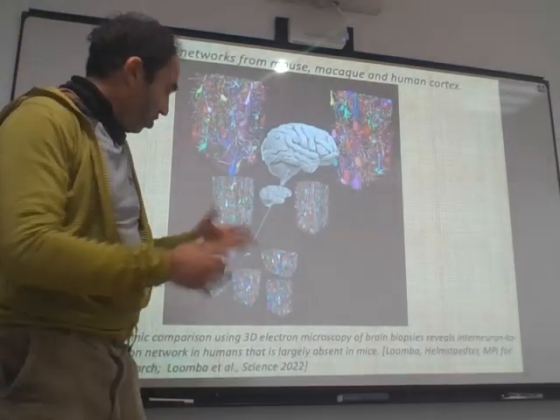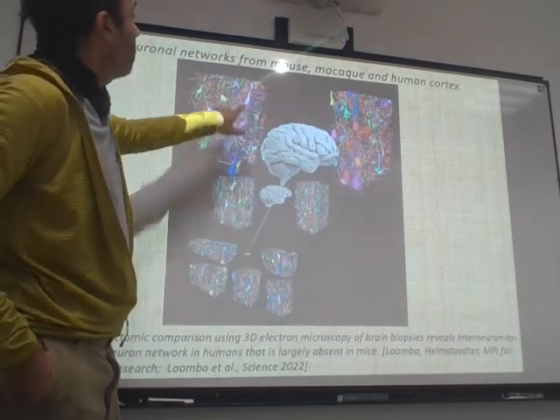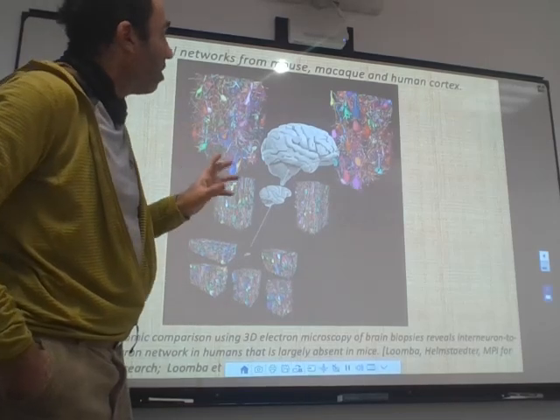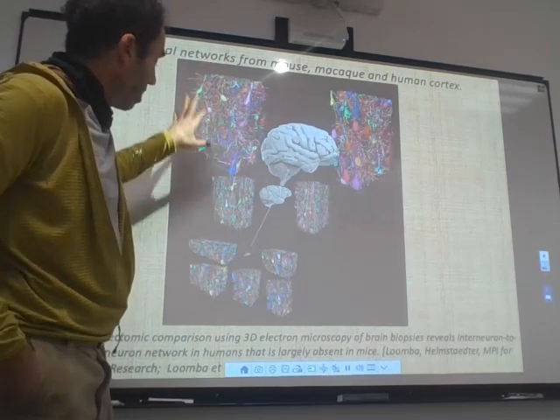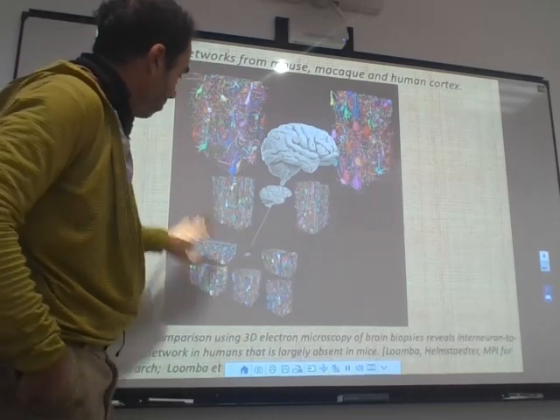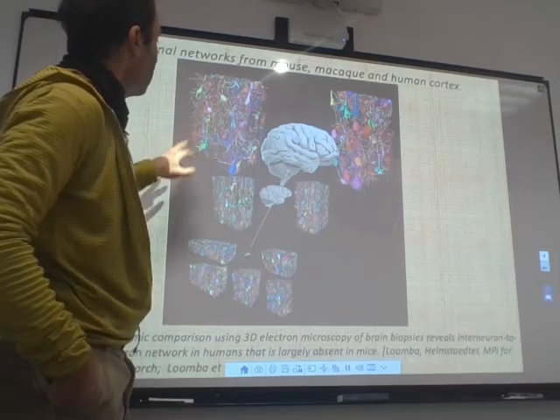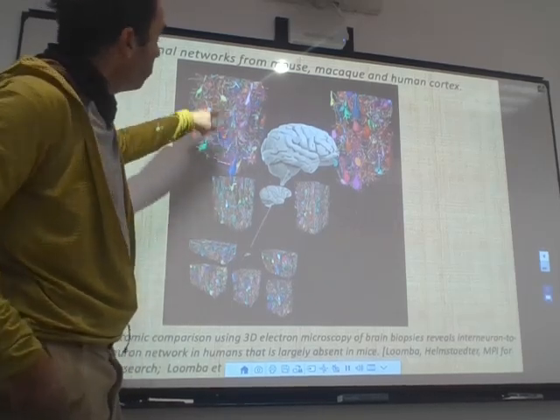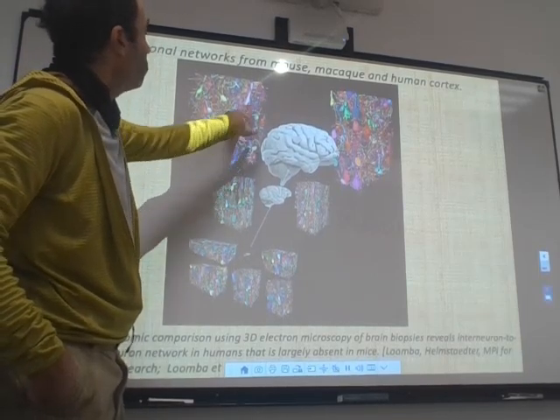Okay, so just to clarify, this is the brain. So now people are able to color each cell. So you know you have each cell. This is different types of brains, so you can have different density. You see here the soma, the cell bodies, and you're interested in, for example, how many synapses this one has with that one.